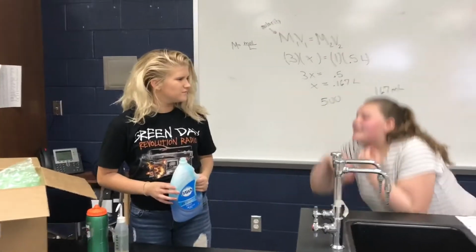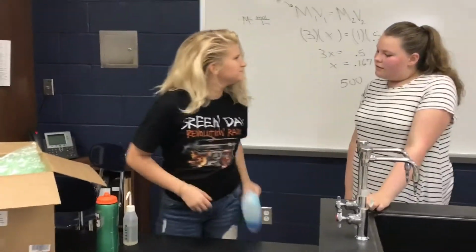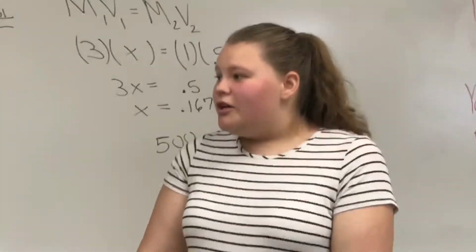What is this? It's Dawn, just look at the label. You're right. Just remember, if it was mislabeled, we could have got really hurt.